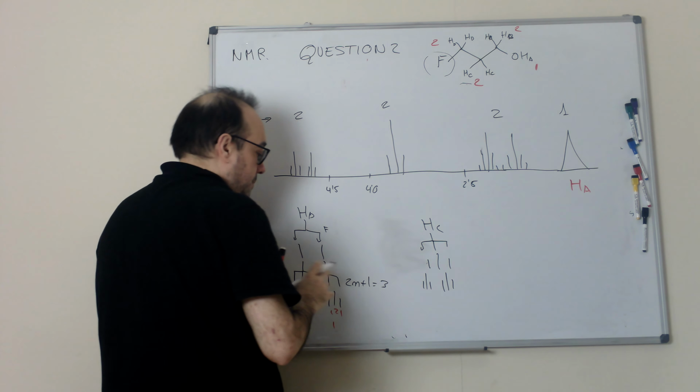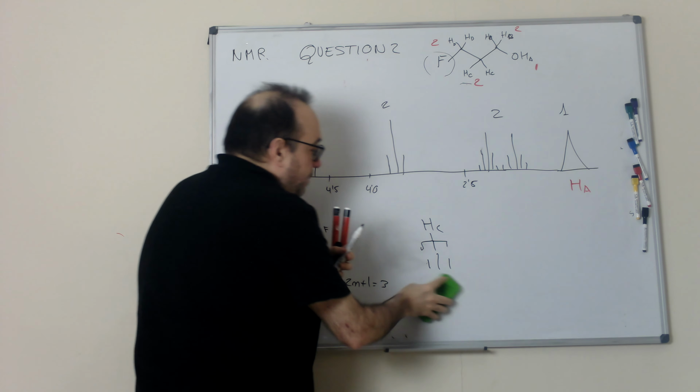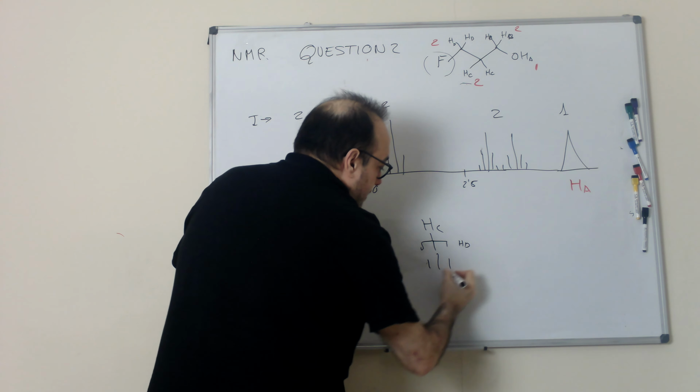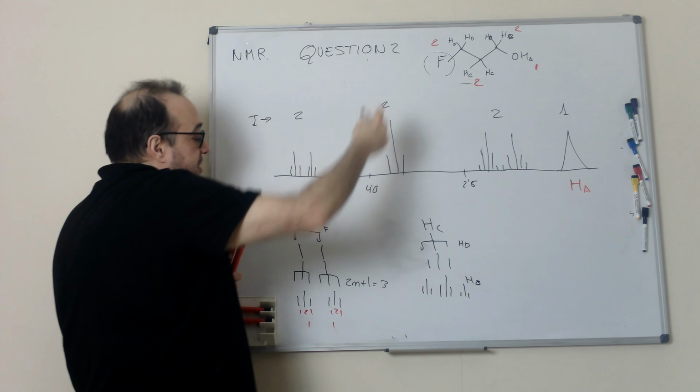Finally, it can also couple with the fluorine, with a J3.